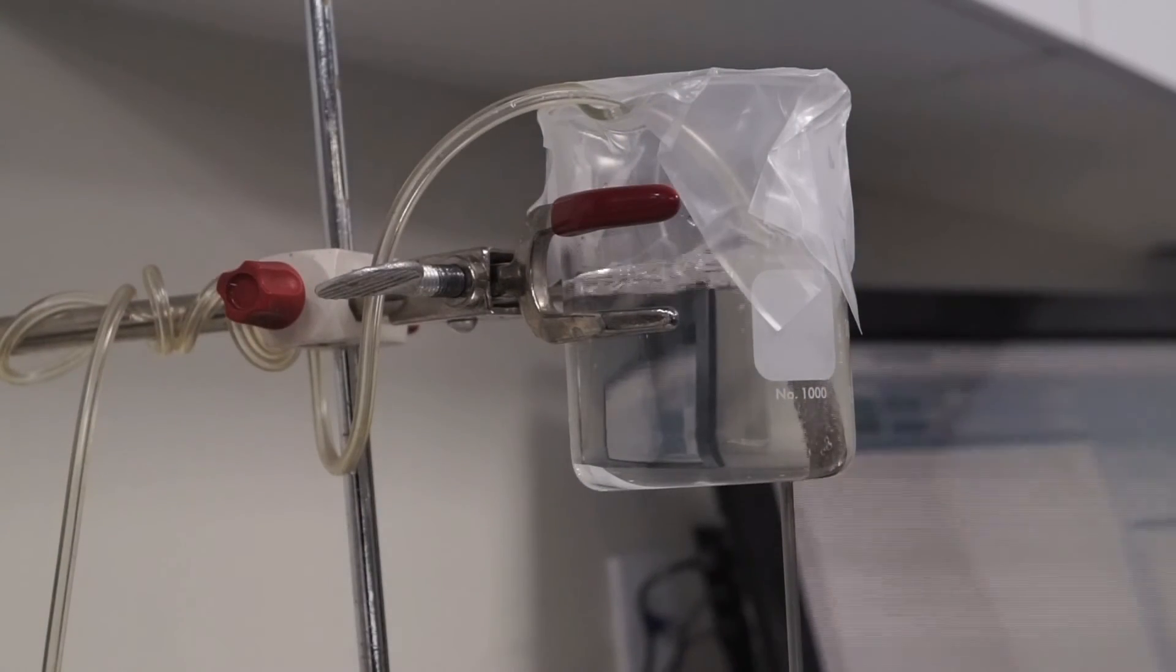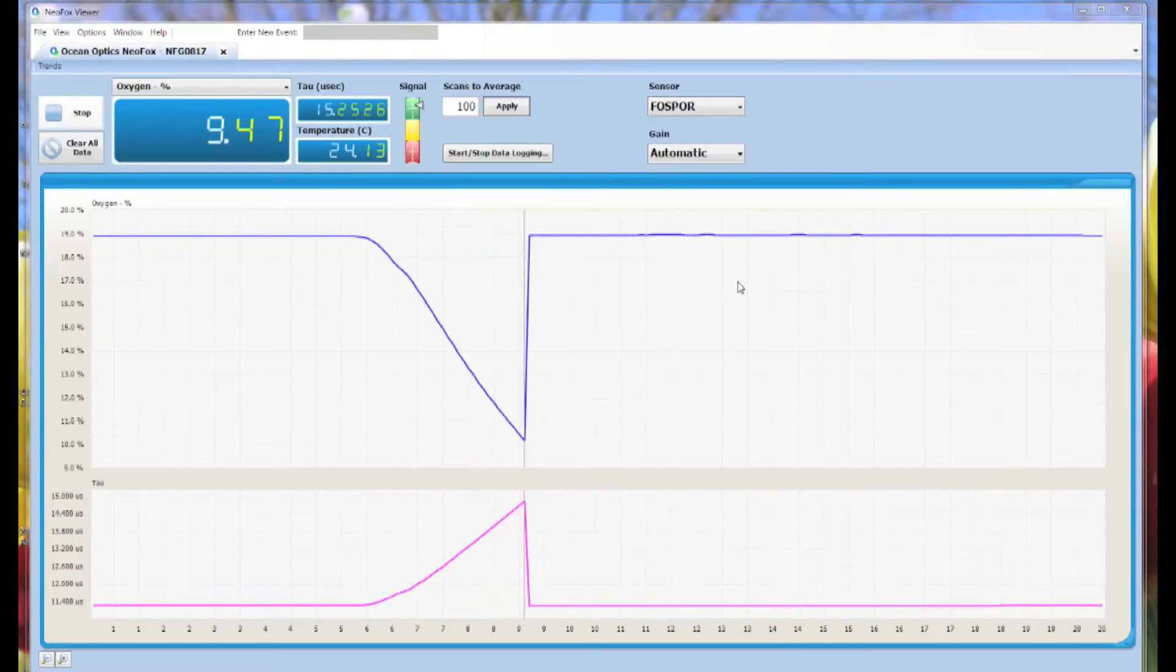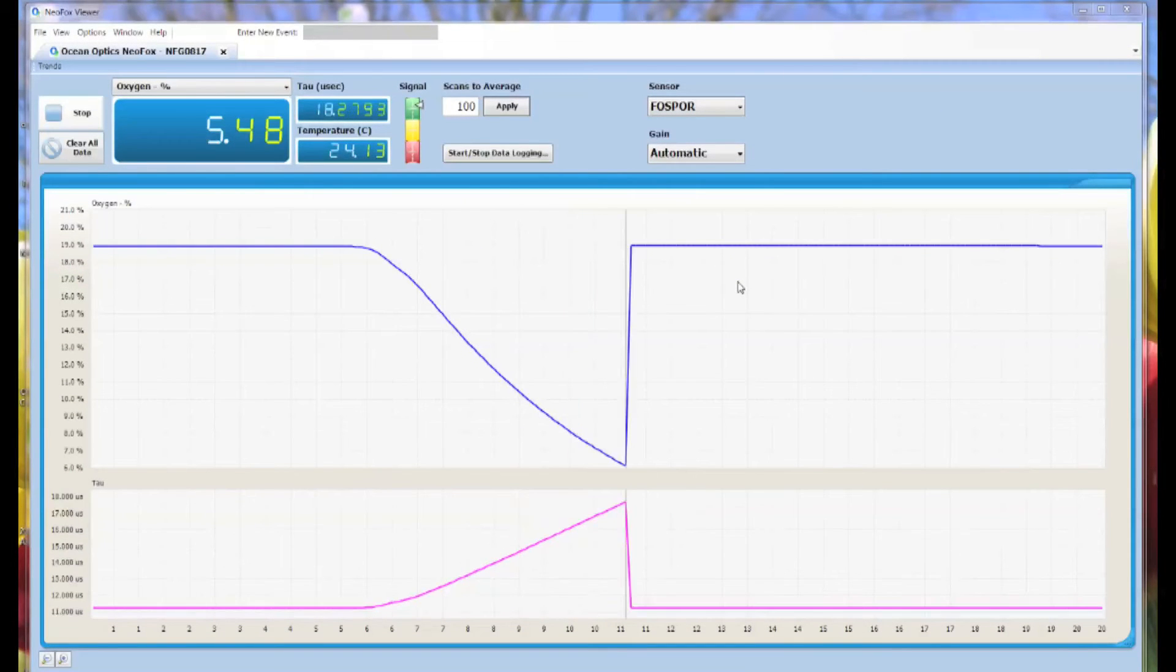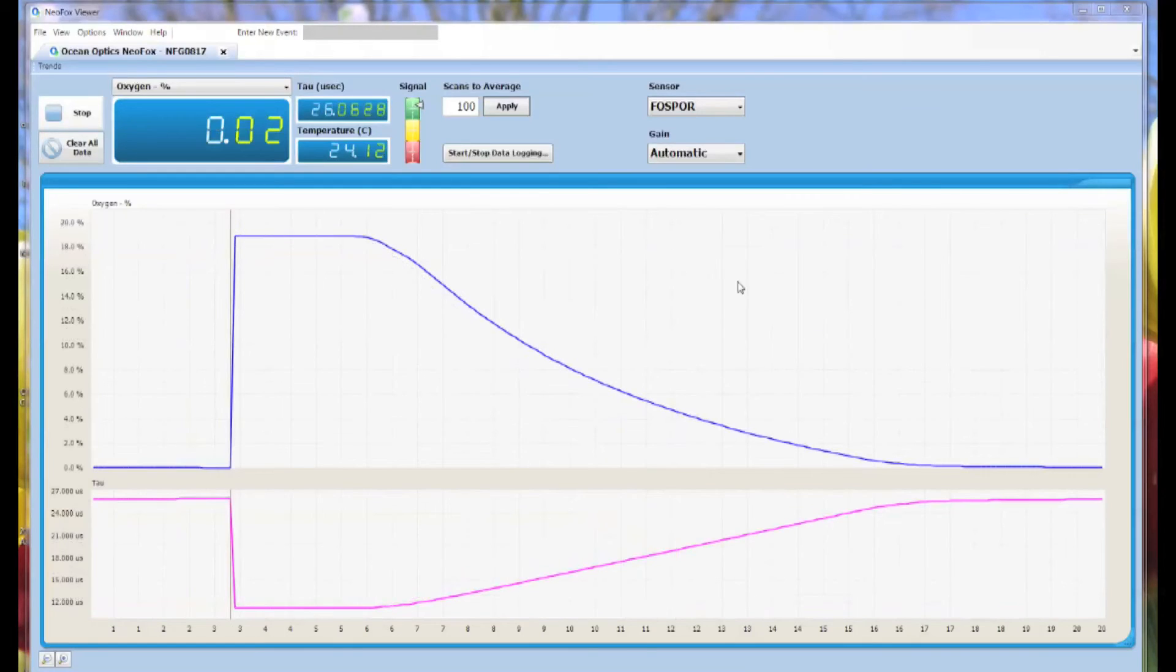Once you've begun purging all the oxygen from your liquid sample, you're going to have to wait for the signal on the NeoFox viewer to stabilize. Depending on the flow rate of your nitrogen and the type of chemistry you've chosen, this can take anywhere from one to five minutes.